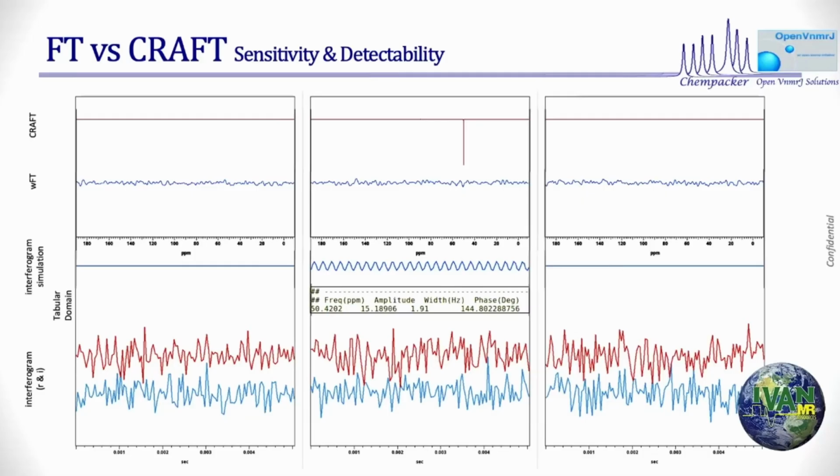That peak is there. You can see that peak right there. But you can't be as certain about it because there's another peak right there. If you come here, there's another peak right there about the similar height. It is the uncertainty of finding something as a peak instead of as noise. That's your problem. That's because you did an FT, and in order to do an FT, you need to do a zero fill. In order to do a zero fill, you need to do an apodization. One feeds to the other. And that's what you can do.